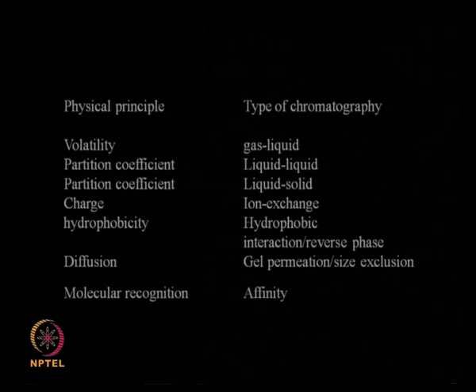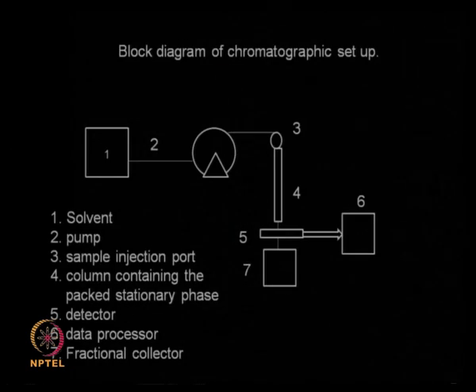So depending upon the principle you want to follow, depending upon the mixture of proteins you want to separate, we may use different types of chromatographies, and all these chromatographies are already being practiced commercially for purifying biomolecules, biopharmaceutical products, proteins and so on. A typical block diagram of a chromatography setup is going to look like this.